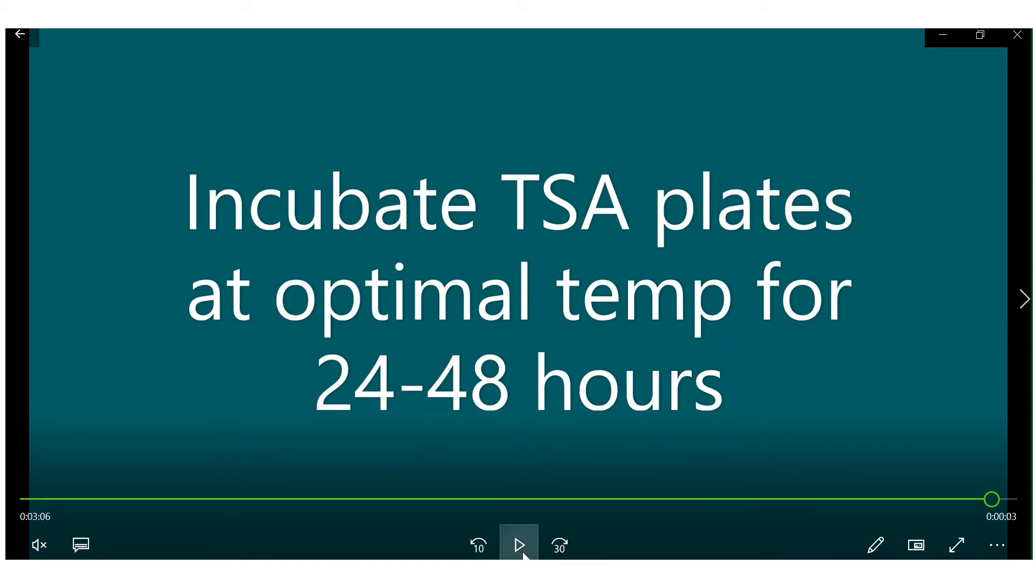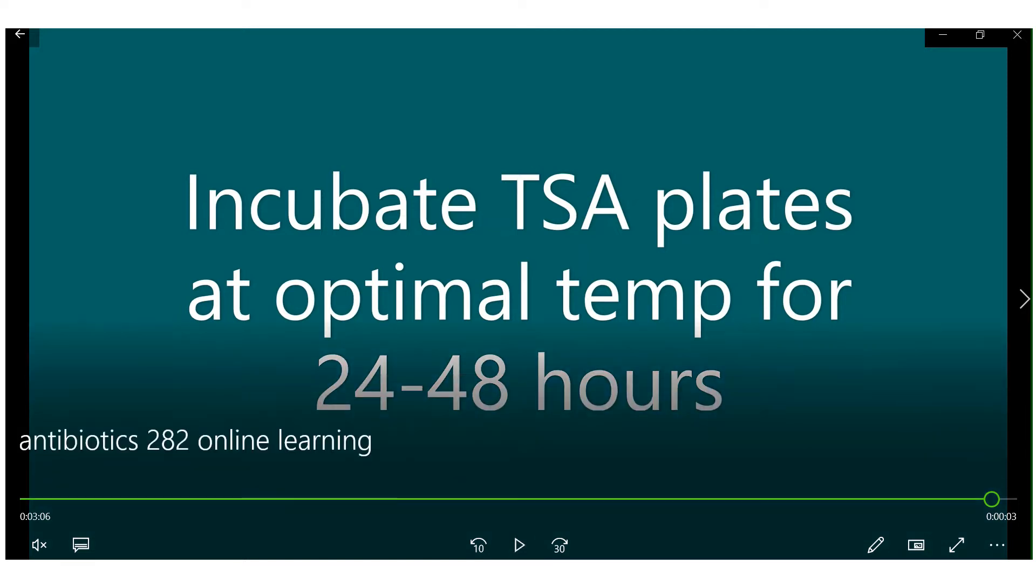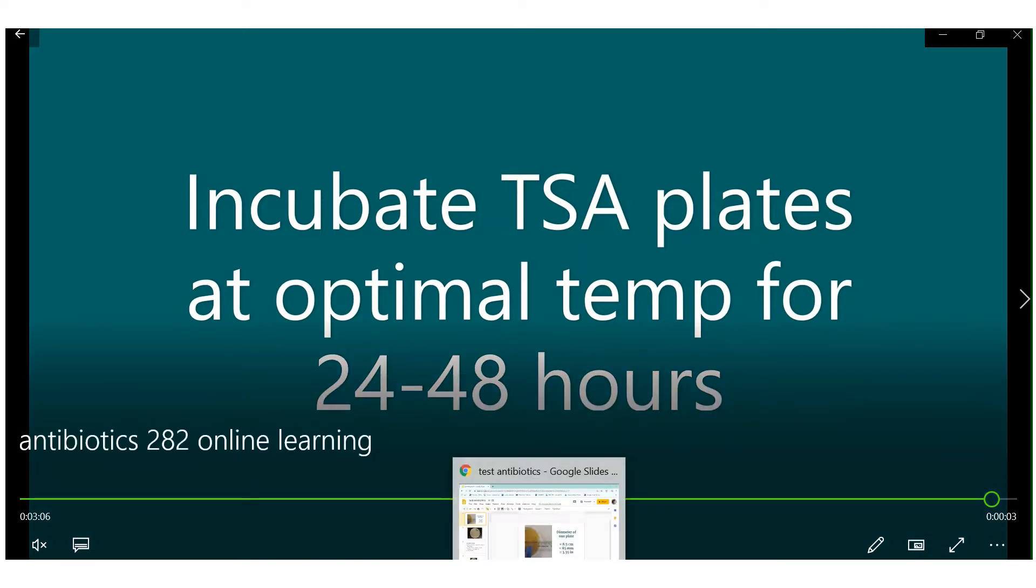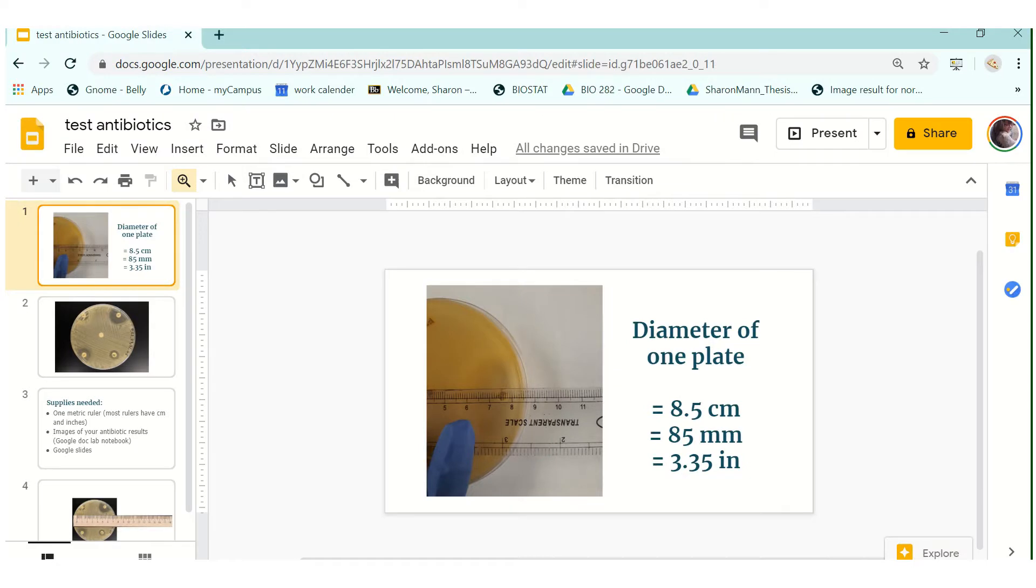Once your plates come out of the incubator then we need to analyze them which I have a separate thing to show you for that. So when your plates come out of the incubator they're going to look like this. They're going to have some growth on it.